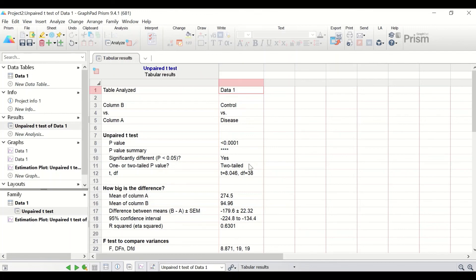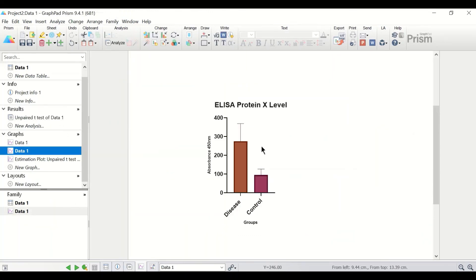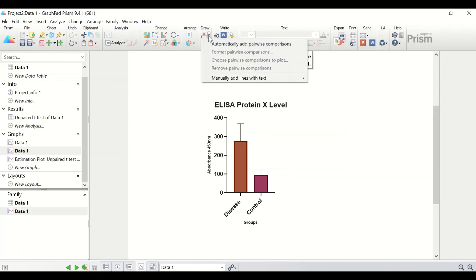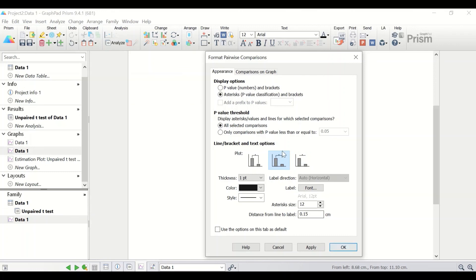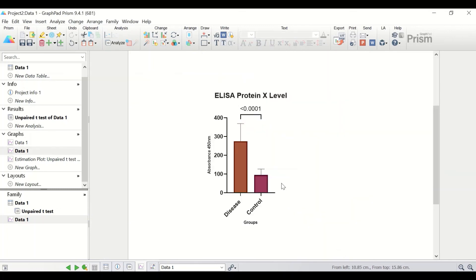The t-test confirms that protein X levels were significantly higher in the disease group. Back on the graph, I will add the p-value to the bar chart by clicking 'Automatically Add Pairwise Comparison,' double-clicking on it, choosing the options, and selecting to display the p-value instead of a significance star. Click OK. The p-value is now displayed on the bar chart. This concludes the demonstration of how to analyze ELISA assay data and construct a standard curve following a quadratic second order polynomial in GraphPad Prism.